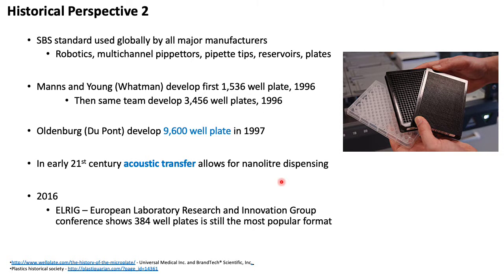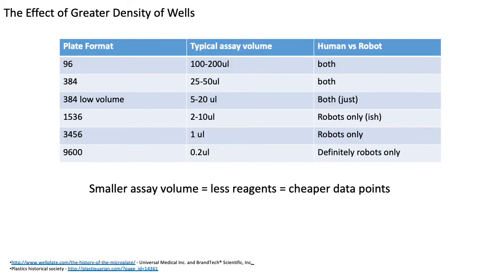And in 2016, at the ELRIG conference, the European Laboratory Research and Innovation Group, they actually showed that the 384 well plate is still the most popular format. So even though we have all these different formats, the 384 well plate is the most popular format.